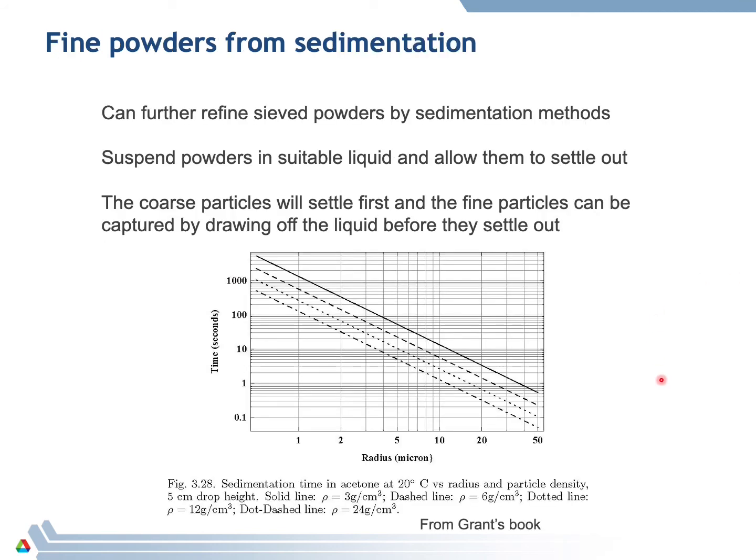So one method that's part of this XAFS school is to use sedimentation to get fine particles. You grind up the sample. You'll have a mix of fine and larger particles. Then you suspend the particles in a suitable liquid, one that's not going to react with the sample, and allow the particles to settle out.